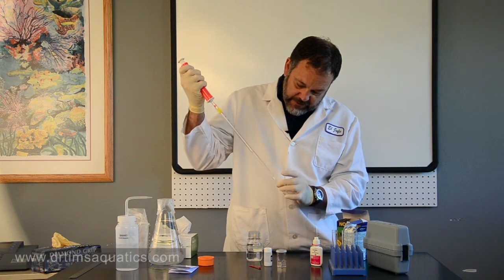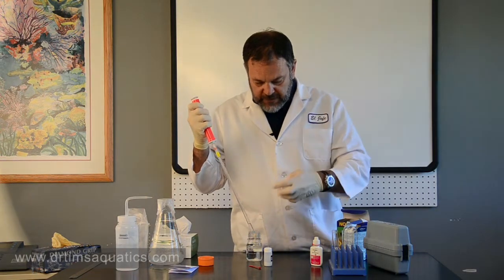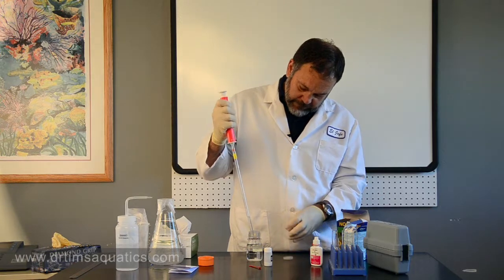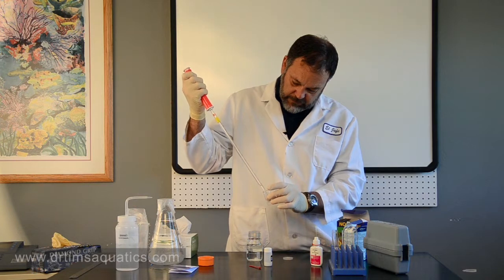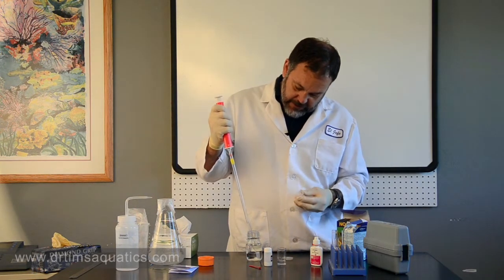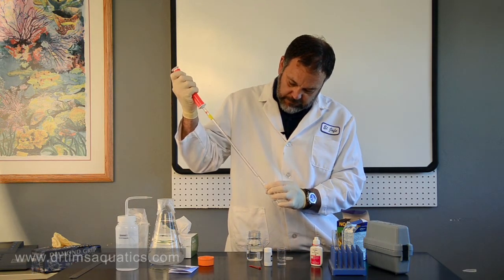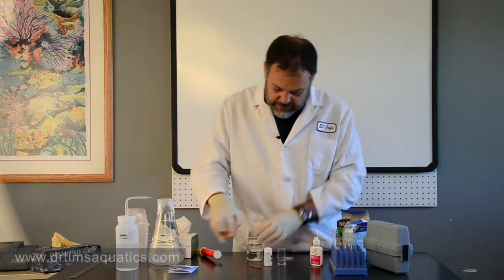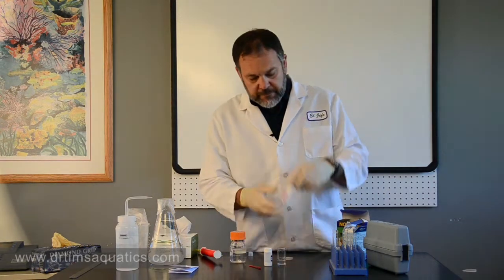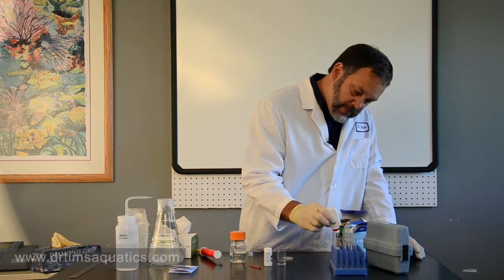Measure out 5 mils for the Salifert kit and the Hach as well. For the Aquarium Farm kit, invert the bottle straight up and add five drops — one, two, three, four, five.